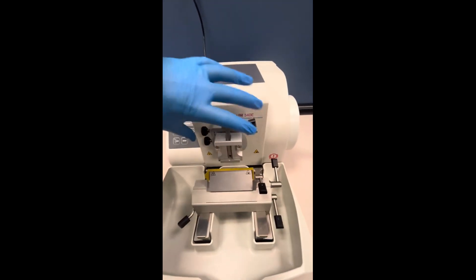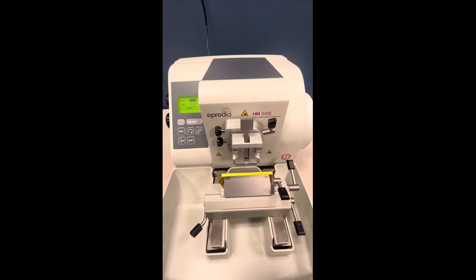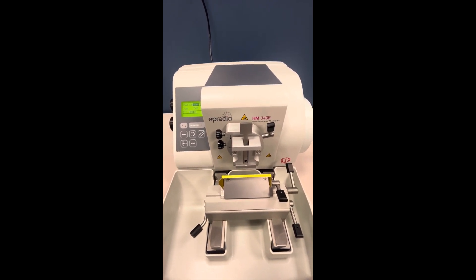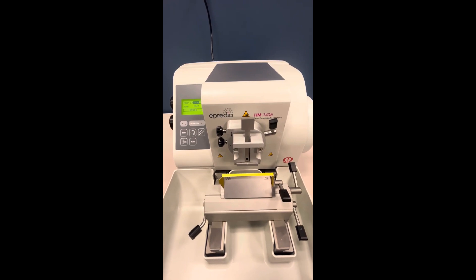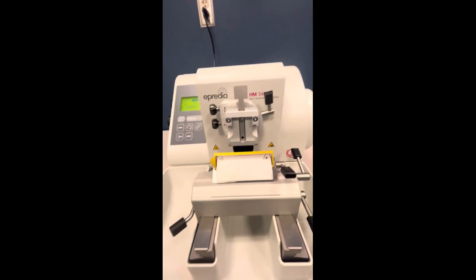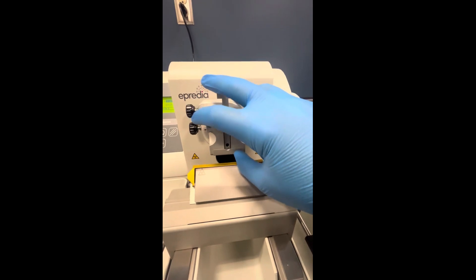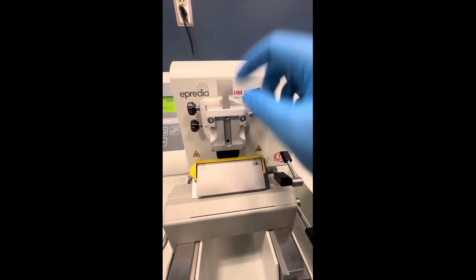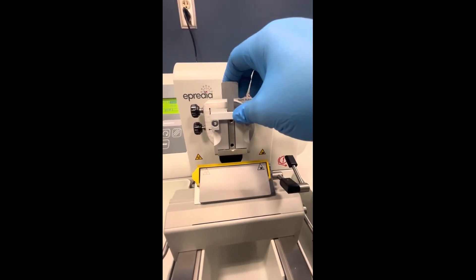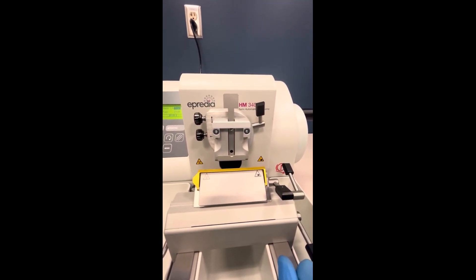This portion of the microtome is called the specimen orientation. This piece allows the tissue specimen to be brought to its desired position to allow it to be aligned with the knife. The specimen actually goes in here — you want to put your specimen in here. To orientate the specimen, there's a lever and some screws.